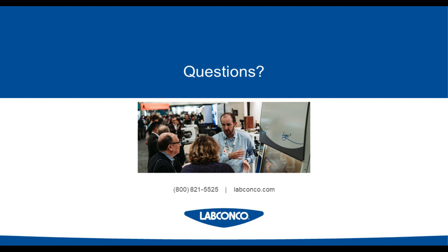So certification in North America is done by third-party groups, and so the first thing you should do is stop using that BSC. And if you don't have an existing company that provides certification to your university or company, then you can probably do a quick Google search. But more effectively, just give Labconco a call, and we can link you up with some certification options in your area. Now, once you identify that person, certification is a fairly inexpensive cost, typically, depending on where you are, somewhere between $100 to $200.